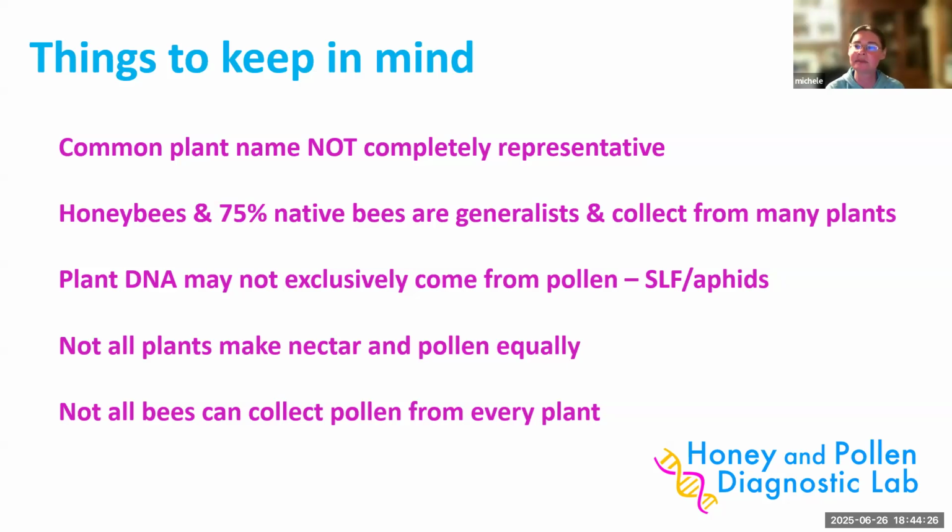But sometimes, depending on what question you're asking, you might have to cater how you do that collection. And if anybody has any specific questions about that, sometimes I'll say, well, collect one sample and then collect another one, and send them both back to me, and I'll just run them both.